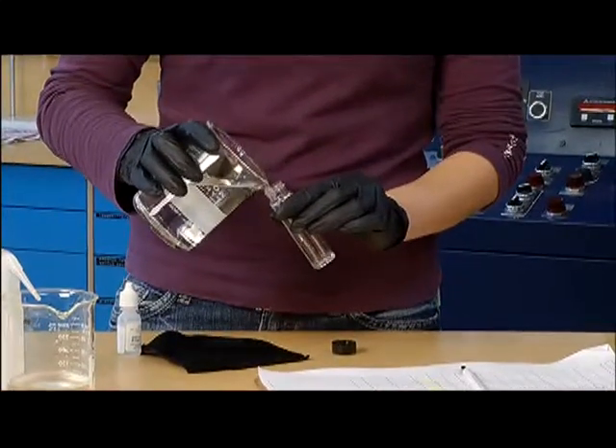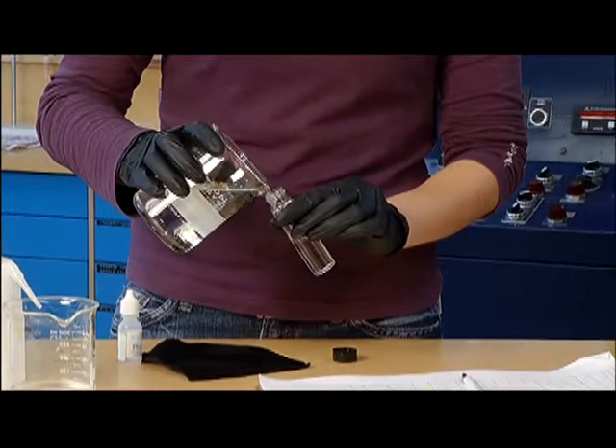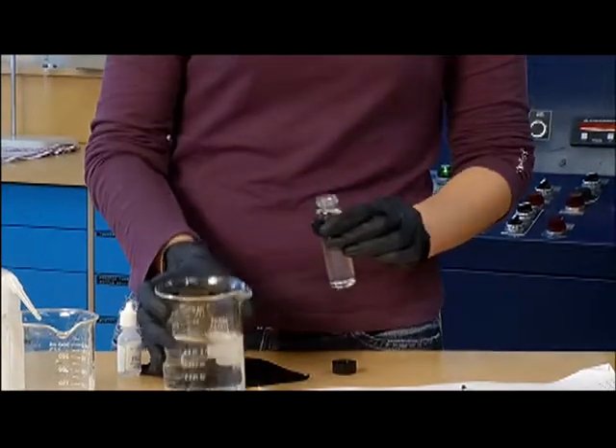Next, pour the sample carefully into the vial to the designated line, being careful not to introduce any air bubbles.